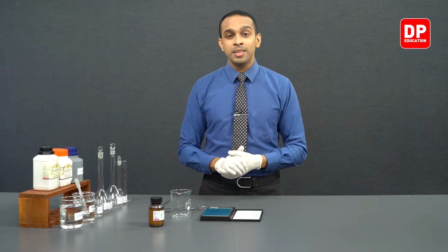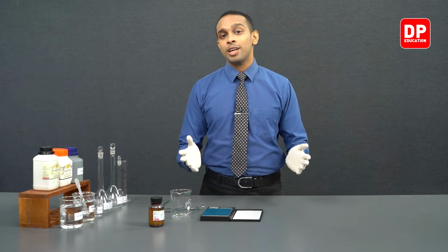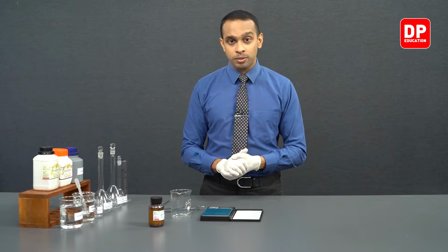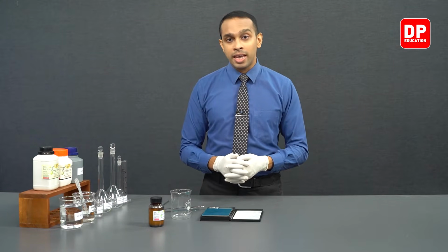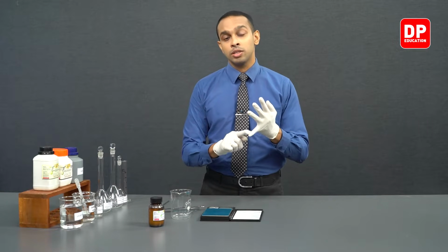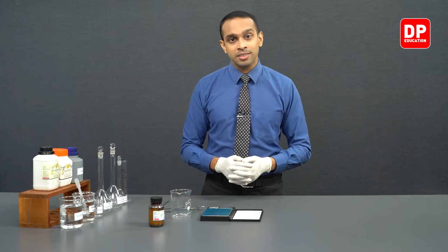Since the molar mass of potassium iodide is 166 grams per mole, the mass we need is 0.3 moles multiplied by 166, which gives 49.8 grams.